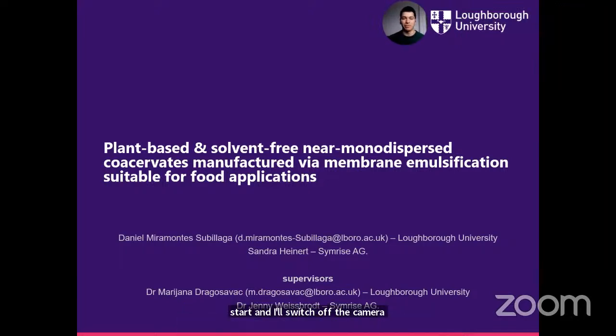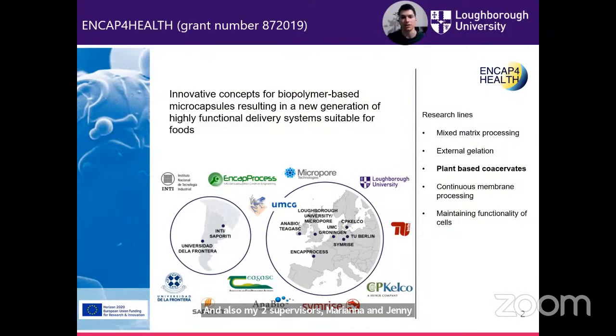Hello, my name is Daniel Miramontes-Subillaga, and I'll be presenting to you the manufacturing of complex coacervate microcapsules via membrane emulsification. I just want to start off by acknowledging Sandra for her contribution to this work, and also my two supervisors, Marijana and Jenny. This project is partially funded by Encap4Health. This particular project sits in the line of plant-based coacervates, although most of the formulations that I'll show today are the animal-based formulation. This was the pre-work to the plant-based system.